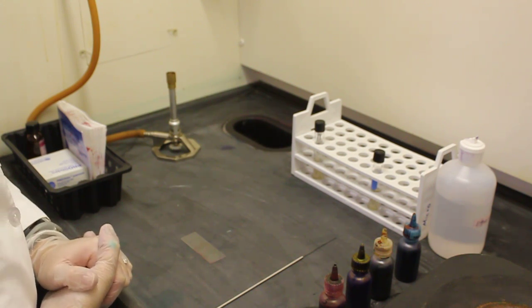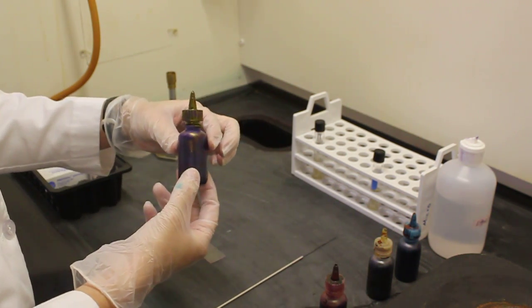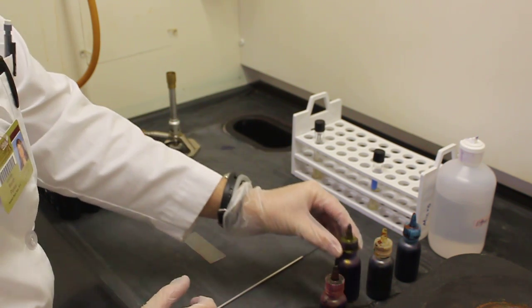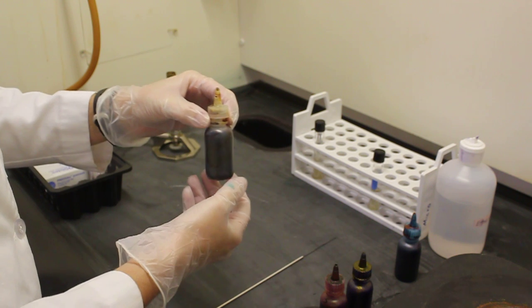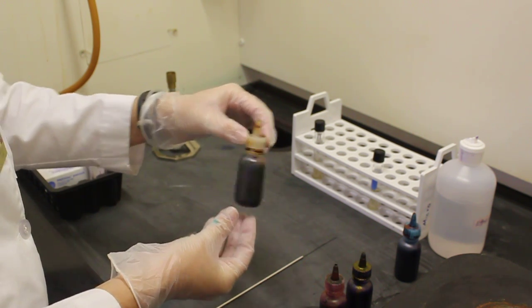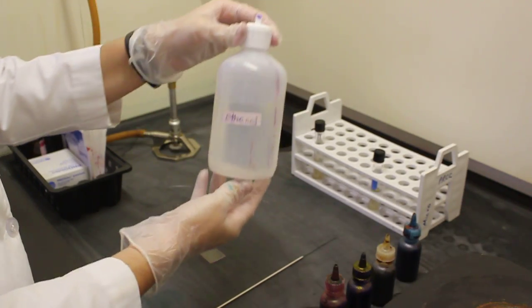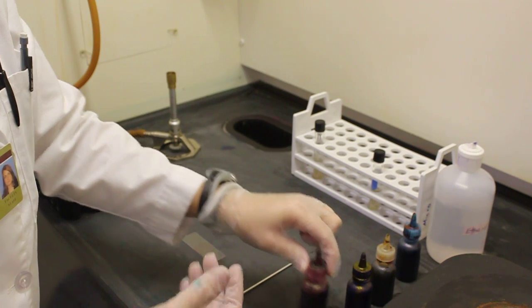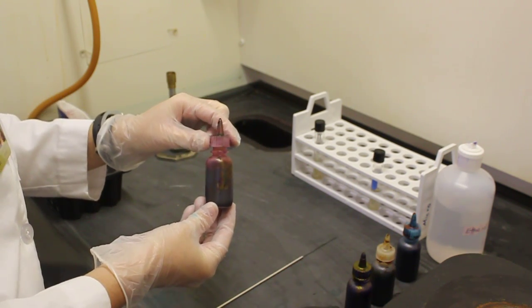The gram stain's four steps in order are: first, application of the primary stain which is crystal violet. Second step is application of the mordant which is iodine. The third step is the decolorizer ethanol, and the fourth step is the counter stain safranin.